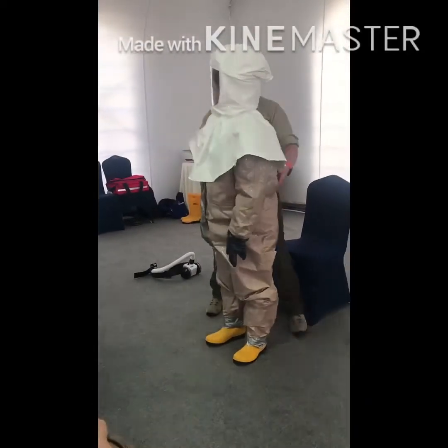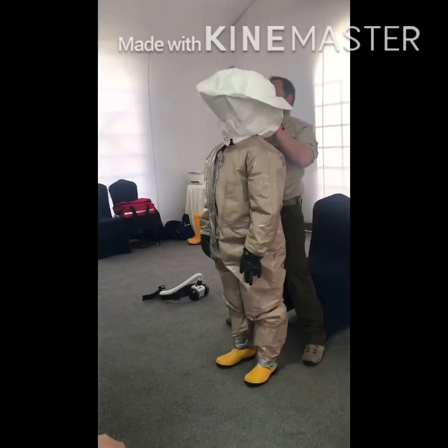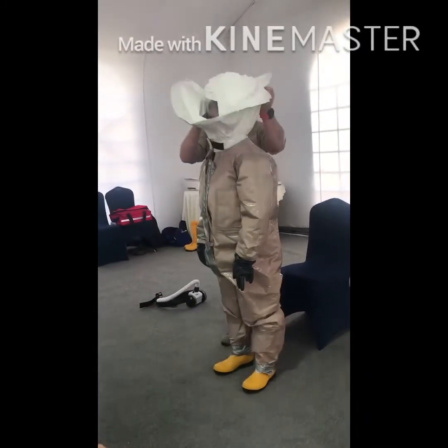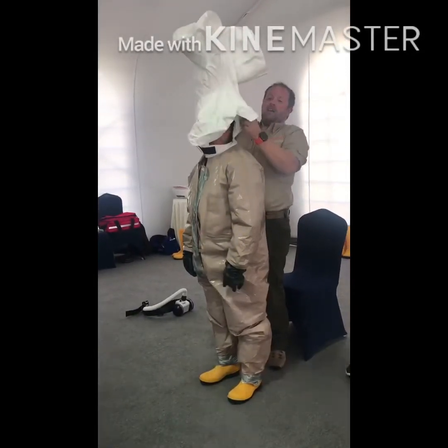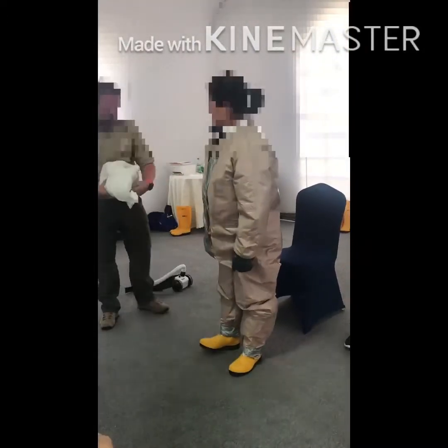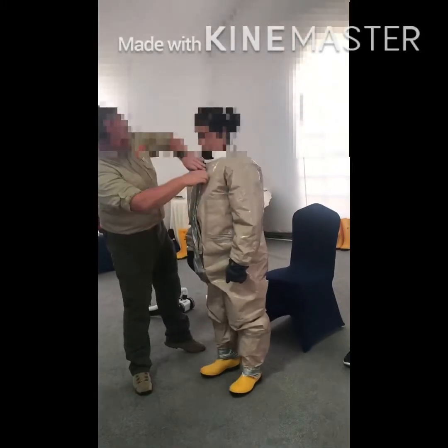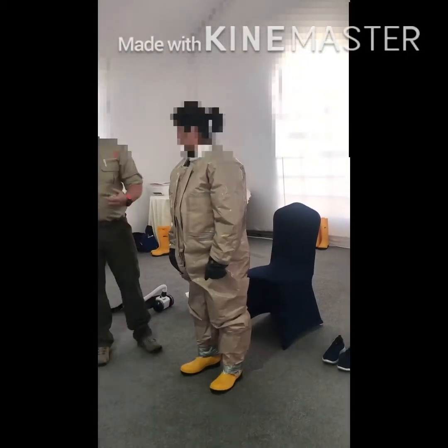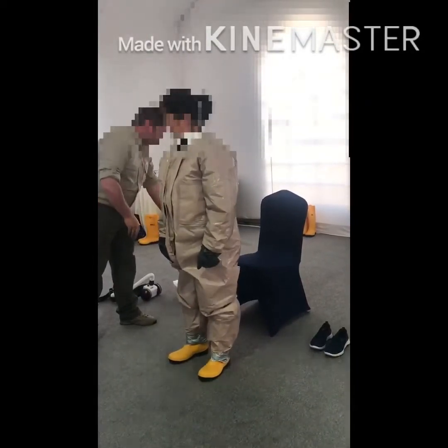And I'm going to remove the hood by bringing the top over and unzipping the front slightly. Ready? Then pull it off and over the head. I roll it inside out. Like so. That then goes into the bin that would be provided. I then remove any tape off the zip. Don't remove the tape from the boots or the arms. You might need to loosen it, but don't remove it. Goes into the receptacle required.